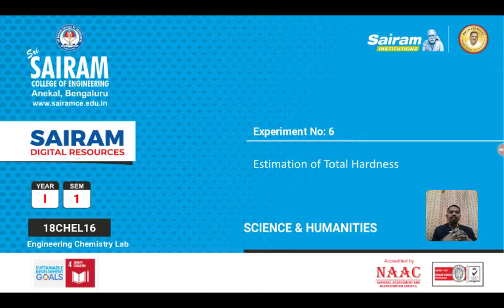Volumetric estimation means we're going to give a sample and then determine the constituents, how much amount of constituents are present, right? So volumetric estimation is titration, it's a classical method. The same thing can be done by instrumentation. The first experiment in this volumetric estimation is total hardness.